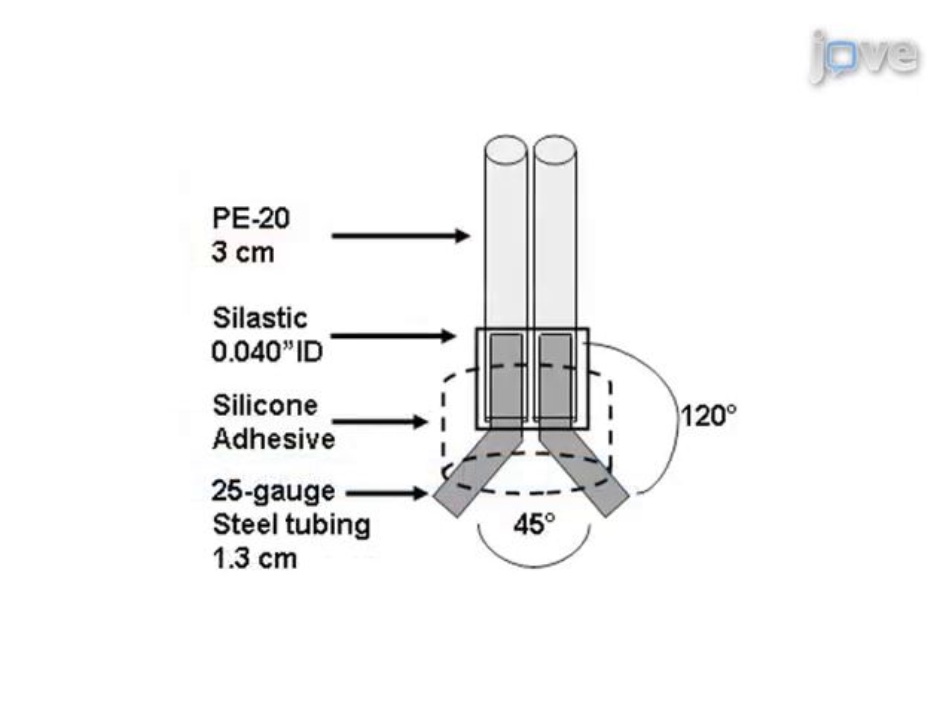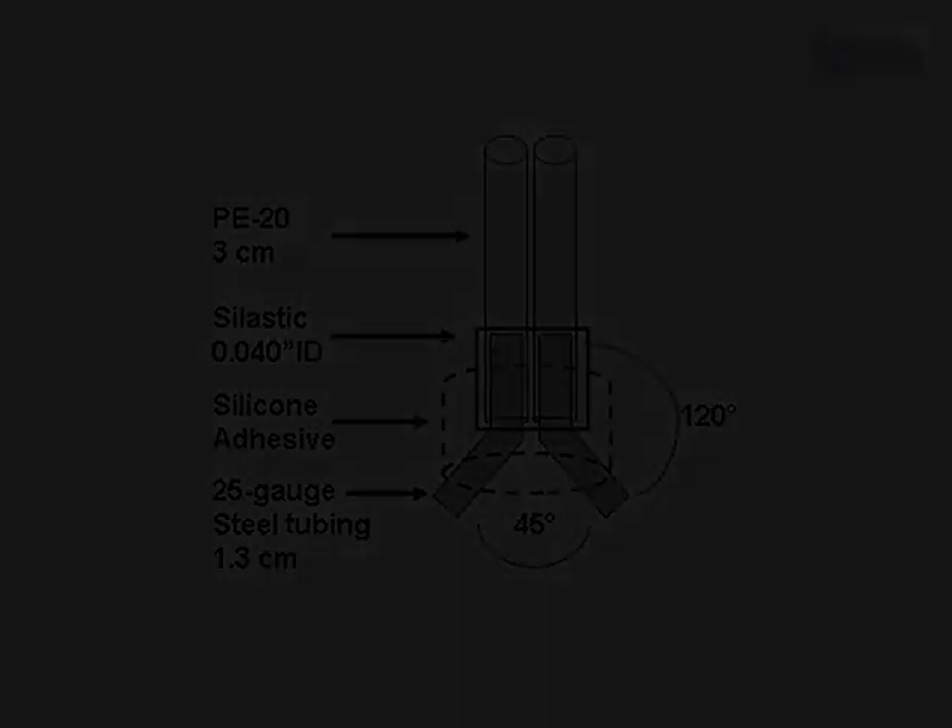The masa is constructed by inserting three centimeter pieces of PE20 into each of two 1.3 centimeter 25 gauge stainless steel connectors bent to an approximate 120 degree angle. These are inserted into a dollop of medical silicone.